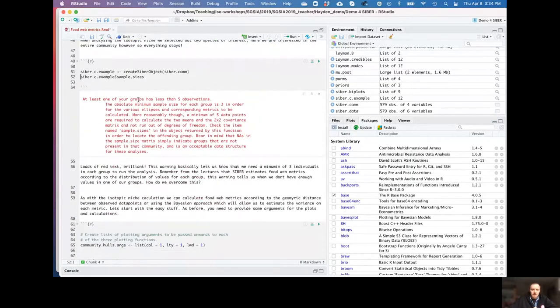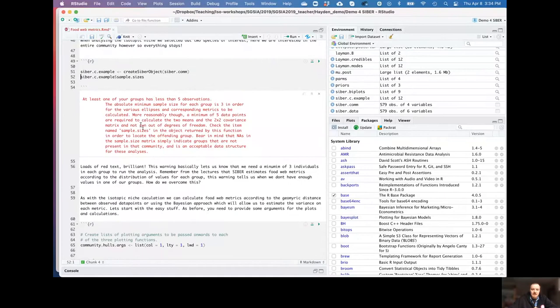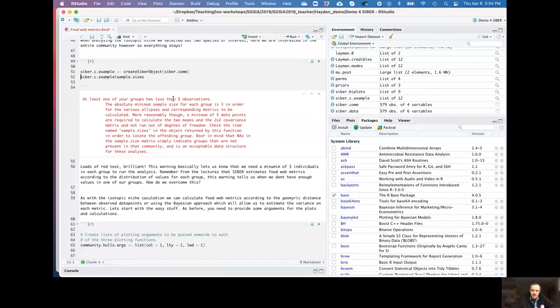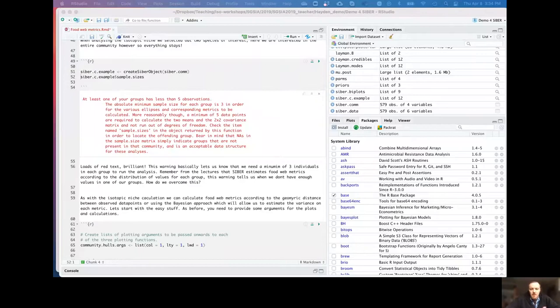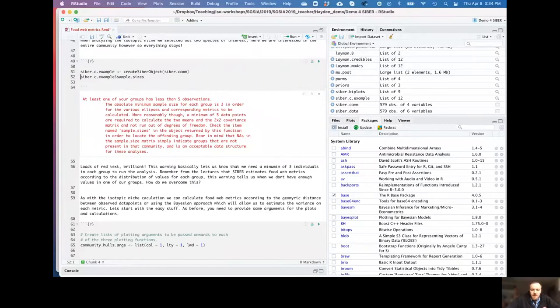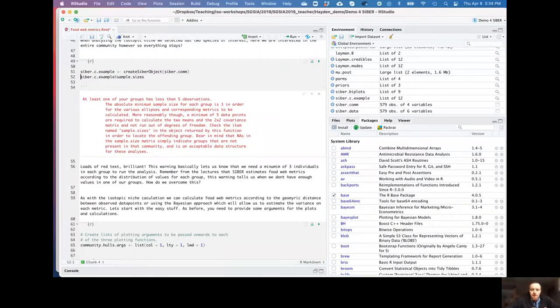So the first thing we need to do is create the community - create SIAR object from the community. Remember the preceding one, we separated this out a bit. But here we're looking at everything, so we're going to create something with the entire community. The first thing we get is a warning with some text here, and essentially this is telling us that at least one group has less than five observations.